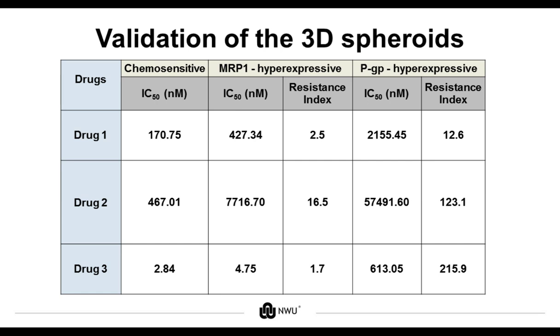By investigating the cell viability, protein content, gene expression, and proteomic data, the efficacy of these drugs against the 3 small cell lung cancer spheroid models is evaluated.